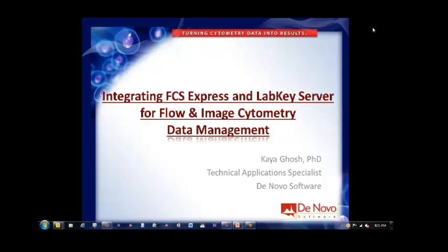Okay, thanks everyone for your attention. My name's Kea, and as Avital said, I'm from De Novo Software. We make software for analyzing flow cytometry and image cytometry data, and the title of my talk today is Integrating FCS Express and LabKey Server for Flow and Image Cytometry Data Management.